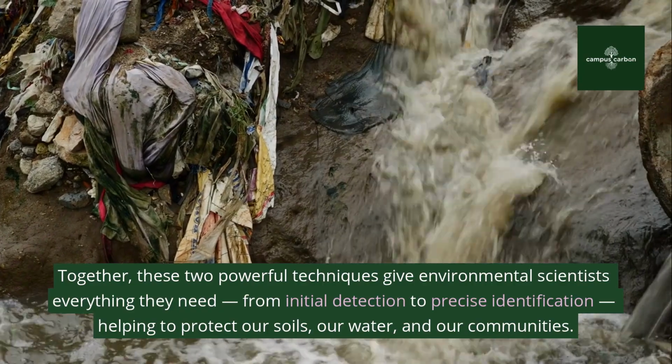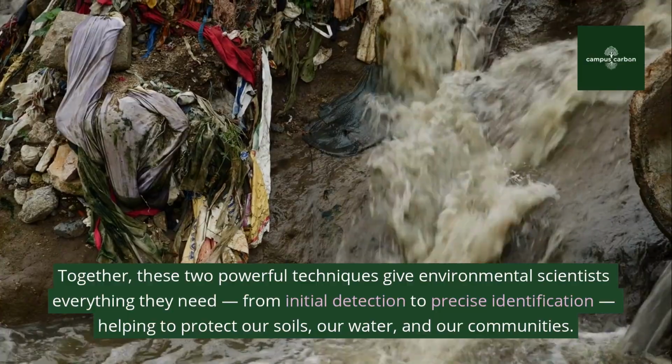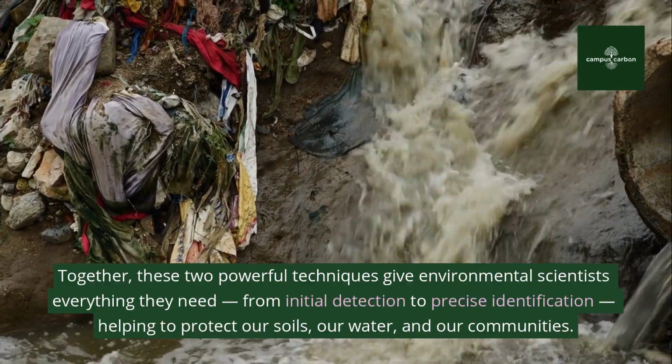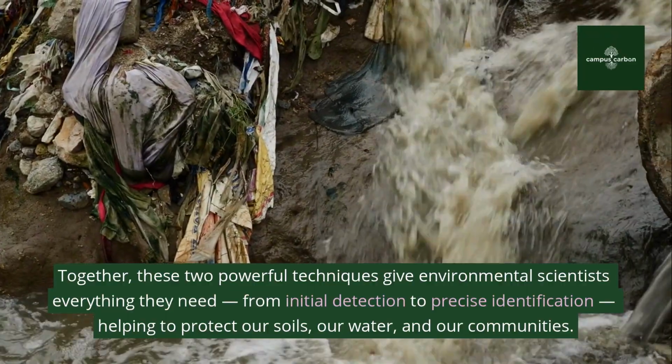Together, these two powerful techniques give environmental scientists everything they need, from initial detection to precise identification, helping to protect our soils, our water, and our communities.